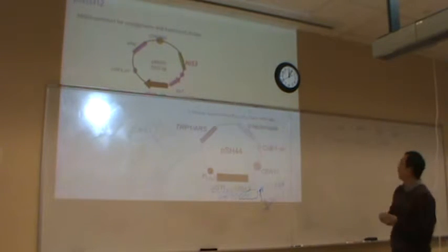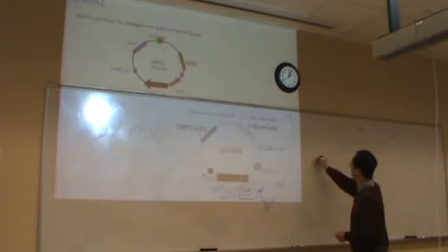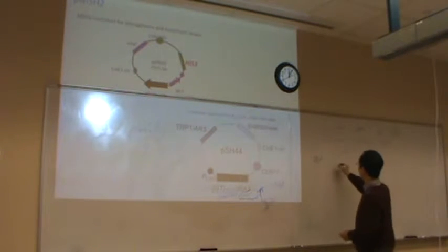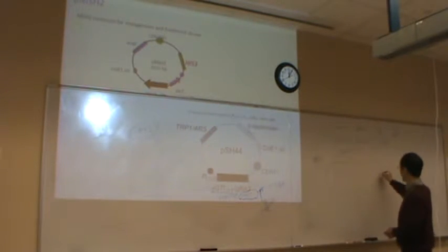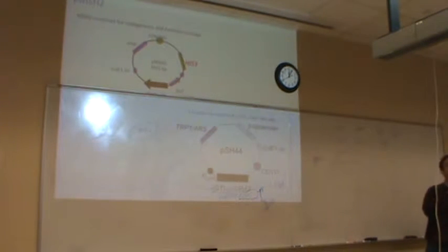Then on the plate, you are going to have an FOA plate, and we're going to put what kind of sample? What's the appropriate experimental design? We need a positive control, a negative control, and we also need the mutant. So we have at least three: positive control, negative control, and the mutant you want to study. Every group has a mutant.